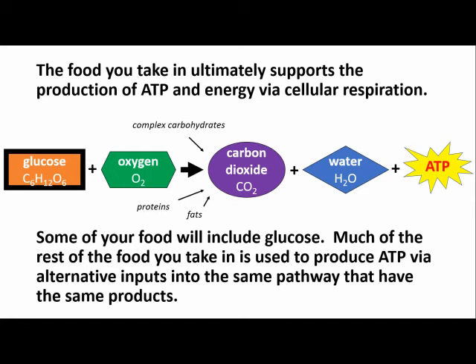Now, I start this lab out with all the materials out and ready for the students, and then we start talking about why they have to eat, where their energy is actually going to come from on a day-to-day basis. And we discuss the fact that the food that they take in ultimately supports the production of ATP and energy through that process of cellular respiration.